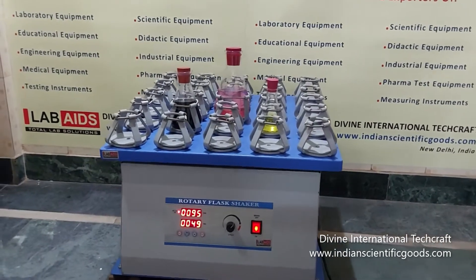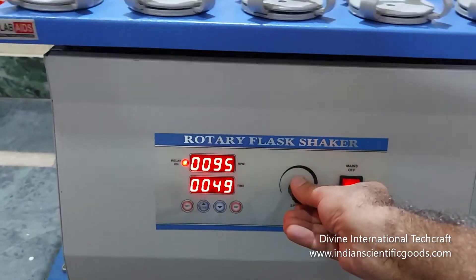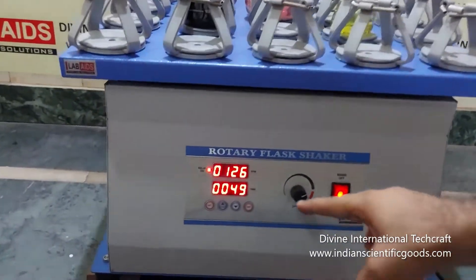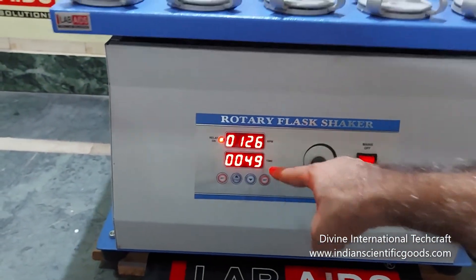DC drive ensures a smooth change of speed that can be varied from 50 to 250 rpm using the speed control knob. The speed is displayed in the digital rpm meter. The time duration of shaking can be set using the digital timer.